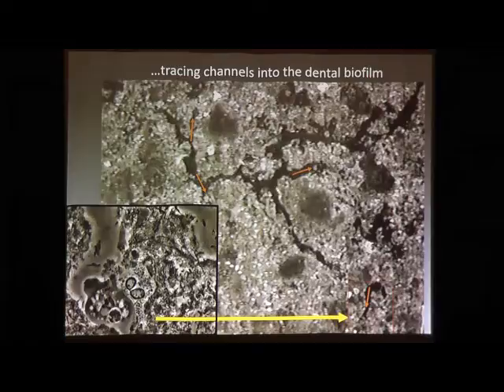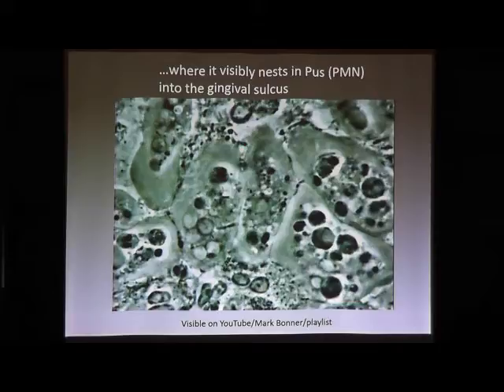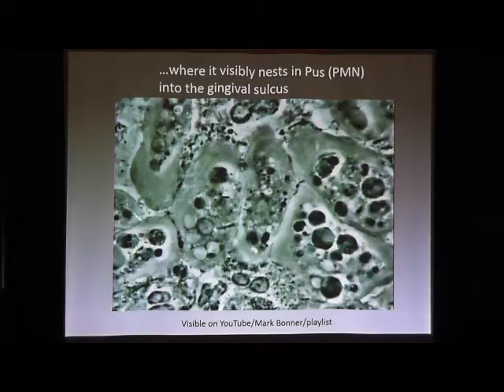We also see the amoeba moving — after five minutes we can see channels within the biofilm and the amoeba traveling from place to place at a certain speed within the gum disease. When the disease is active we see nests of those parasites — not just one but eight, ten, twenty or more — living within the pus among neutrophils at the bottom of your gum.